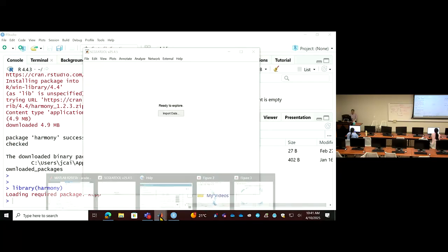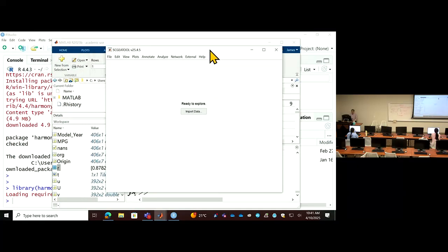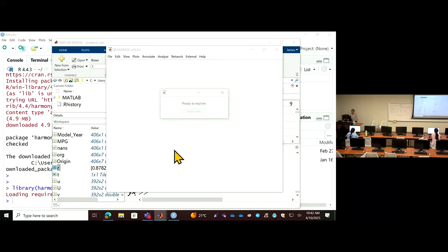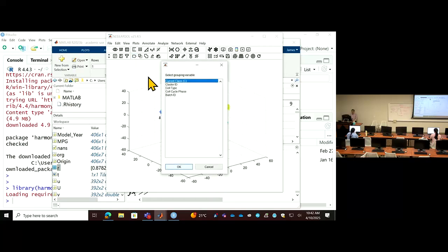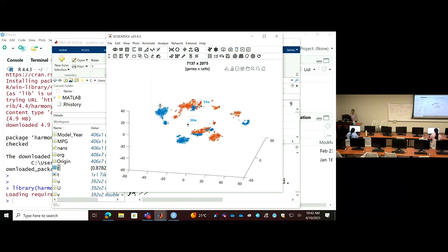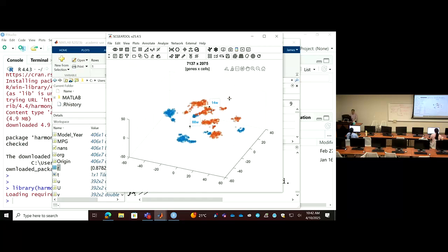Okay, now we can come back to MATLAB. You don't have to worry about R anymore. From here, we can just load example data, processed. Then from the label, the cell group, we can label the batch ID, so we know this data contains cells from 8 weeks against 14 weeks.